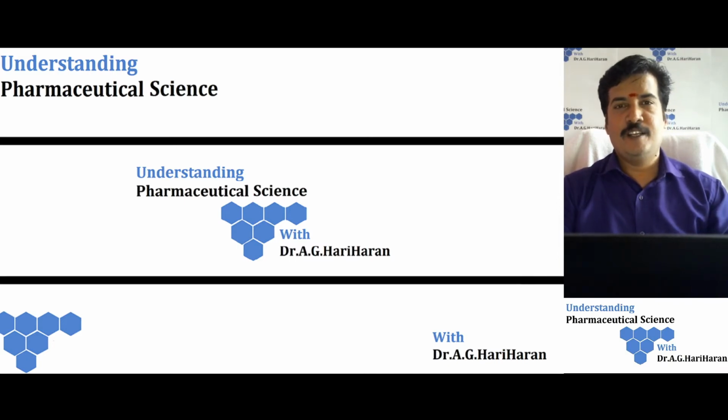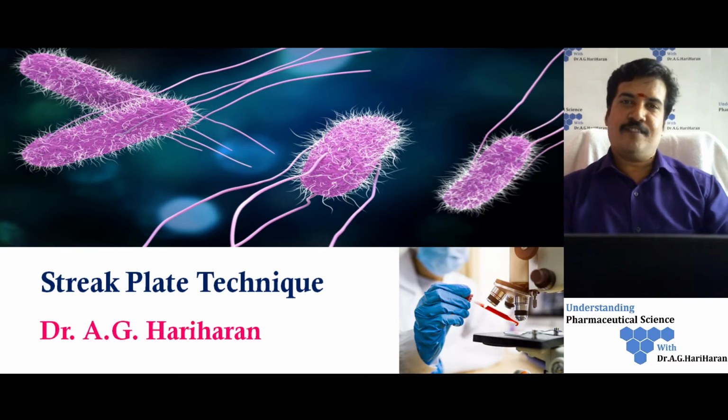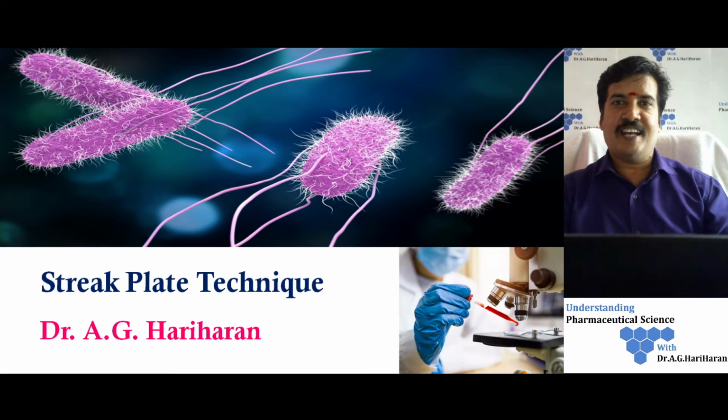So today we are going to discuss one of the important techniques of isolation of pure culture, that is the streak plate technique. In this lecture, first we understand what is meant by a pure culture and how the isolation of pure culture is performed, and in the second stage we will elaborately understand how the streak plate technique is performed.